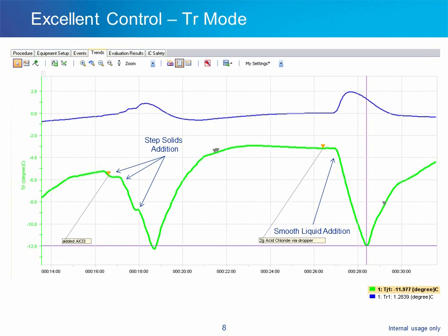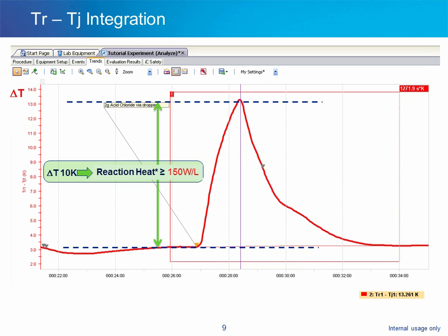As reagents are added, the temperature of the reaction mass is well maintained. The temperature of the reactor jacket immediately responds by lowering to just under minus 12 degrees after the addition of the aluminum chloride, allowing less than a 1-degree change in the temperature of the reaction mass. We can see the heat flow from the addition of the acid chloride by calculating the difference between the temperature of the reaction mass, TR, and the temperature of the jacket, TJ. A heat flow of 10 degrees Kelvin equates to a reaction heat of greater than 150 watts per liter.